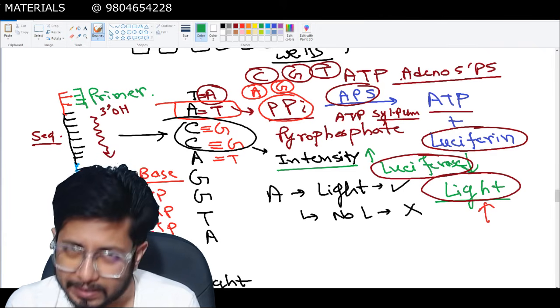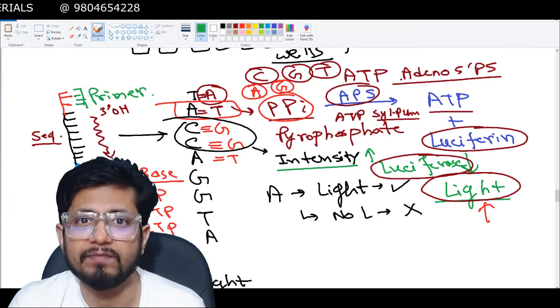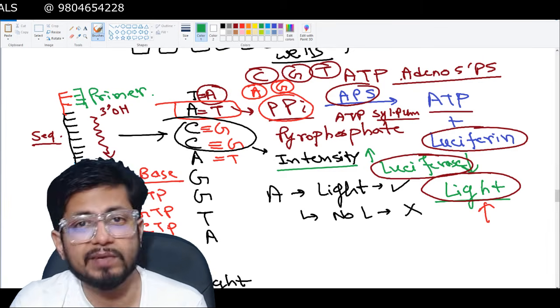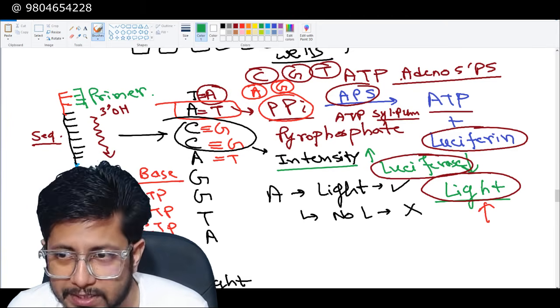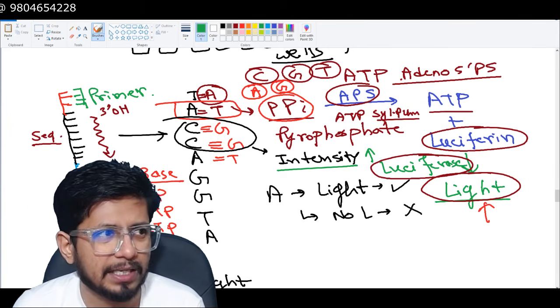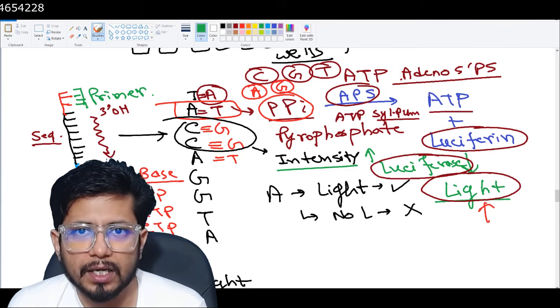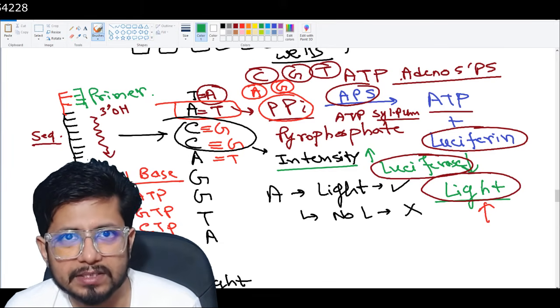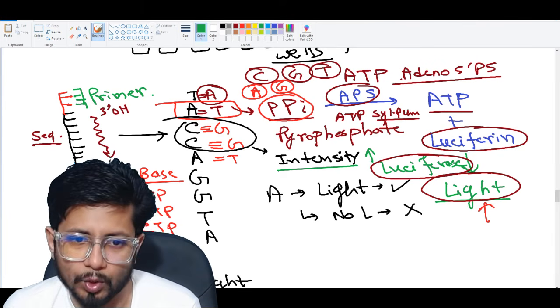Besides, we have a better cost effective model. We have Illumina sequencing, which is comparatively cost effective, comparatively less pricey than 454 sequencing, and also less chemical involvement is in there. So considering these two facts, the DNA sequencing method that we use nowadays is primarily the Illumina mode of sequencing.